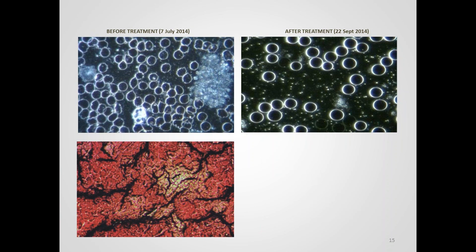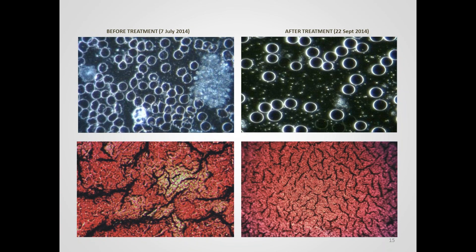Now this is called broken fibrin in blood analysis, and this is considered an indicator for a blood sugar imbalance, and it's definitely linked to conditions like insulin resistance. A very sensitive indicator for this condition, and we're often able to see this long in advance before any other investigations show any abnormality. We can see the degree of improvement that has taken place there. The example on the right-hand side is really what we aim for in dry blood samples. That's what we want to see in a healthy example.